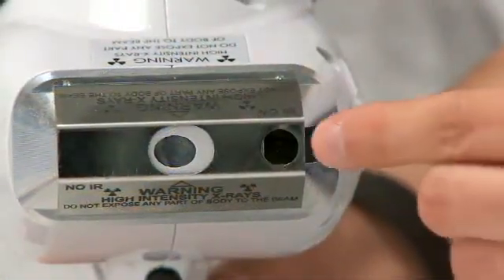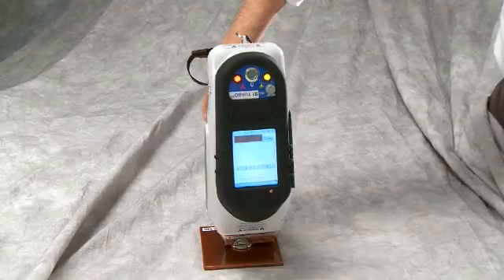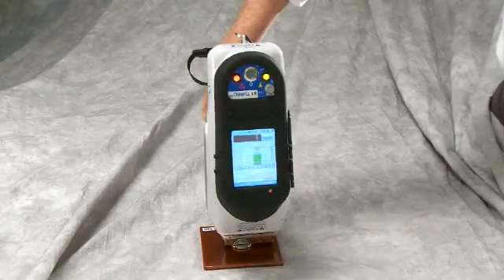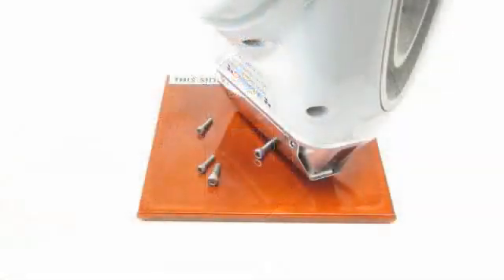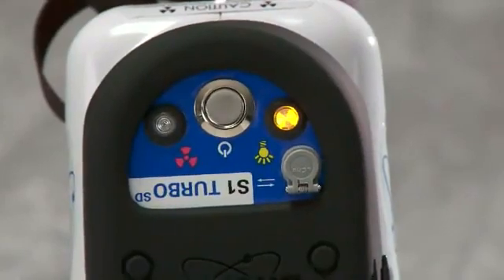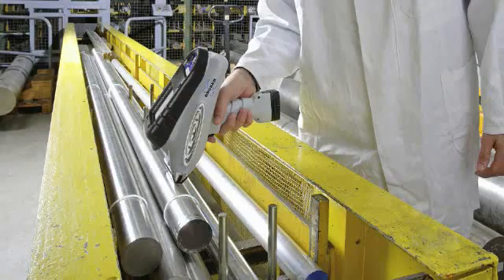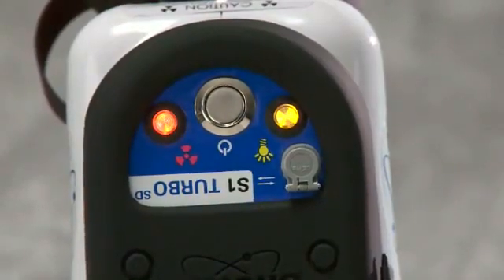The IR sensor in the front of the analyzer is an important part of the safety circuit. This sensor detects reflected infrared radiation and confirms that a sample is in place in front of the analyzer. If the sample does not cover the IR sensor, the safety circuit will not allow x-rays to be generated. The red light on the control panel will not illuminate and no measurements can be made. Once the IR sensor is satisfied and the trigger is activated, the red light on the control panel will illuminate and the measurement will begin.